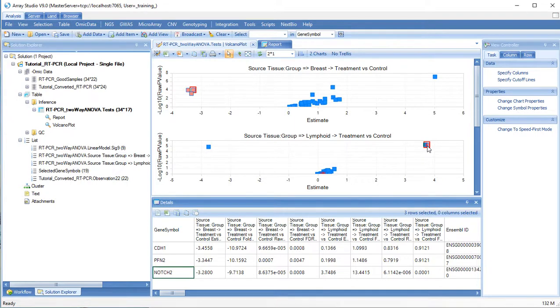For more complicated experimental setups, you can always construct a general linear model. If you have numerical values associated with different samples, such as different concentrations of a compound, you can also use correlate covariate.